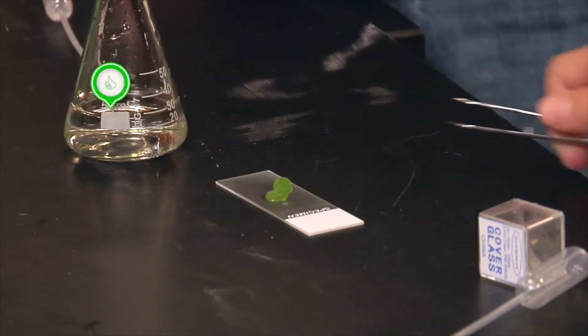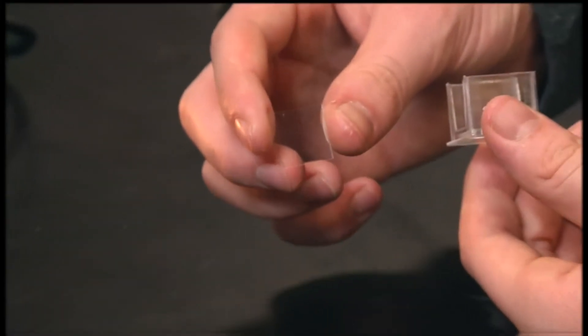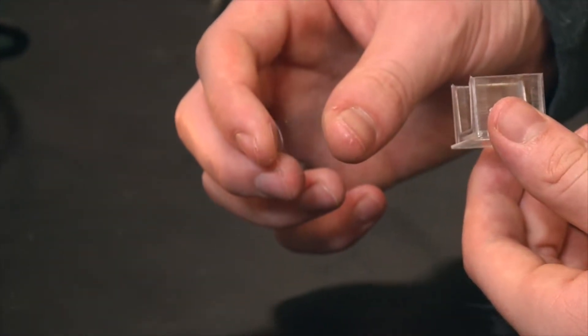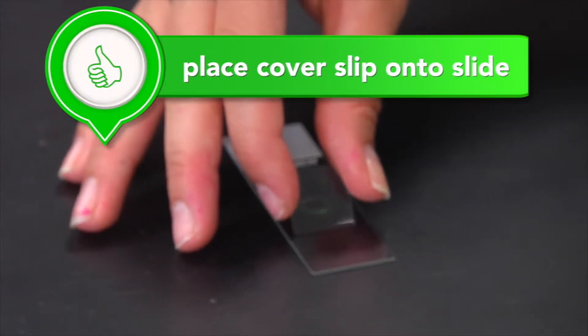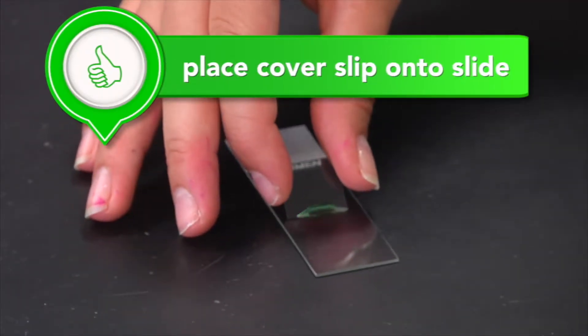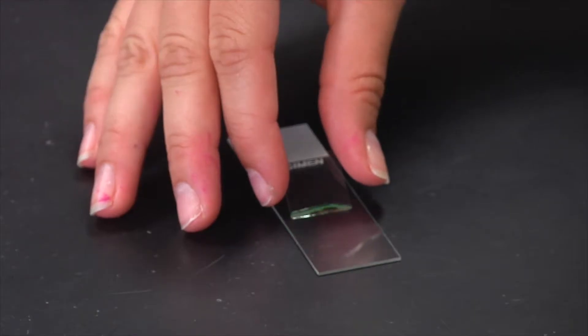Ideally, you should use forceps gently to handle the specimen. Next, take a cover slip, holding it by the sides again to avoid putting fingerprints on it. Touch one side of the cover slip to the microscope slide. Then allow the cover slip to drop on top of the specimen.